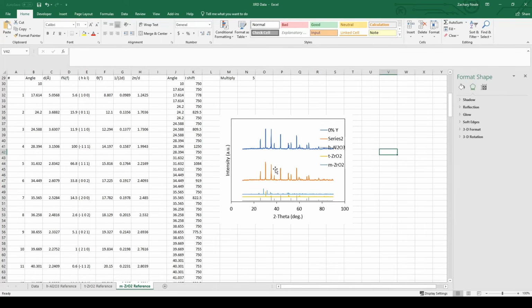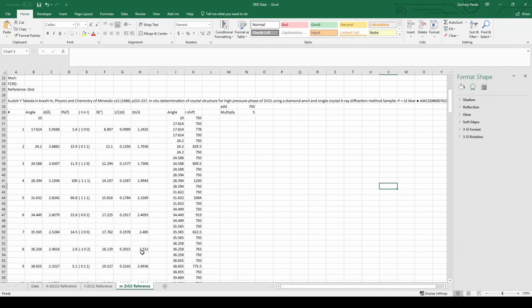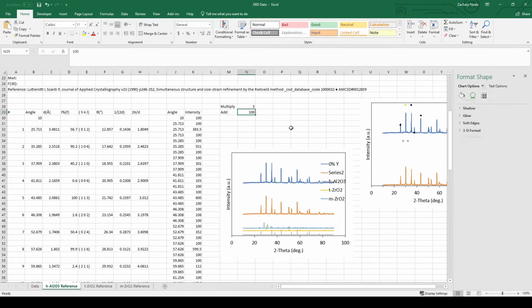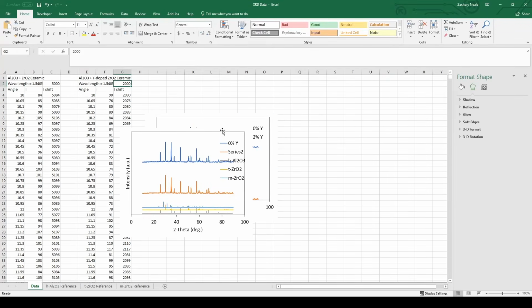Okay. That might be okay. Go back here. Go back to the data. Let's change this. So that's too close. That's better. That looks good.